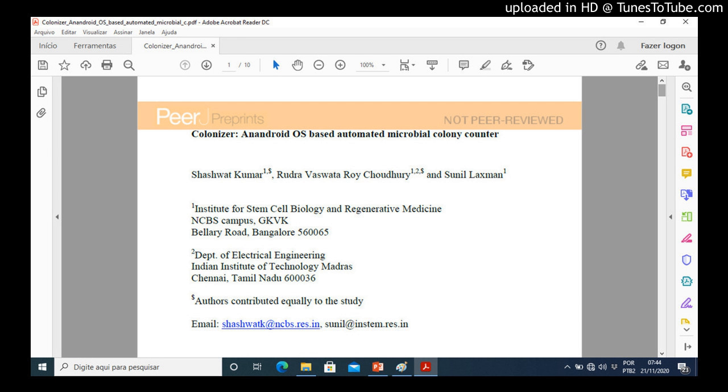We use a small cardboard box, as shown in Figure 1A and B, with a small hole to ensure uniform illumination, as described in the Materials and Methods. This setup reduces interference due to non-uniform lighting and removes any noise from the edges of the petri dish.